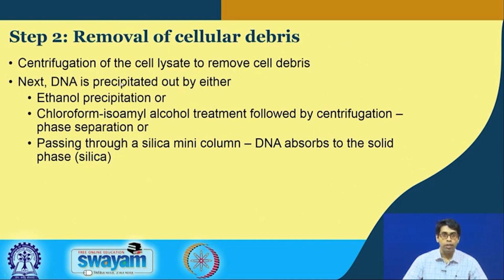Now, to purify the DNA and remove it from other small molecules and these monomeric nucleotides, we precipitate the DNA by some non-polar solvent. For example, we can use ethanol or we can use chloroform isoamyl solutions to precipitate the DNA and remove the supernatant, and now we have this white precipitate in these two steps, which will be mostly pure DNA.